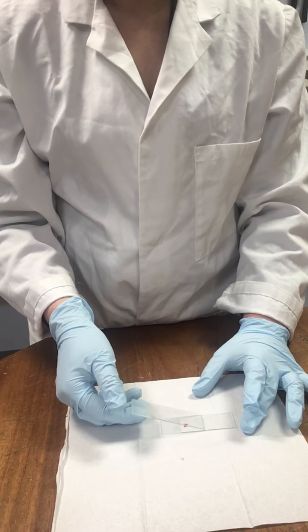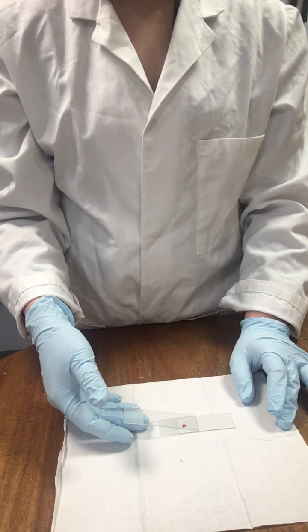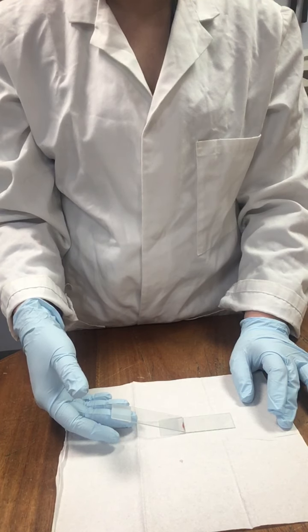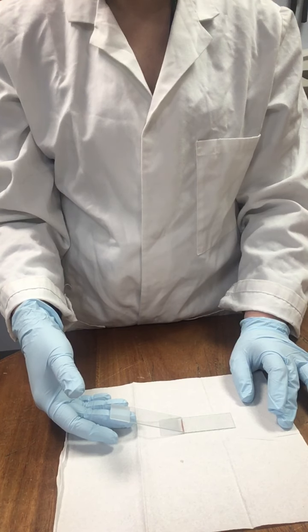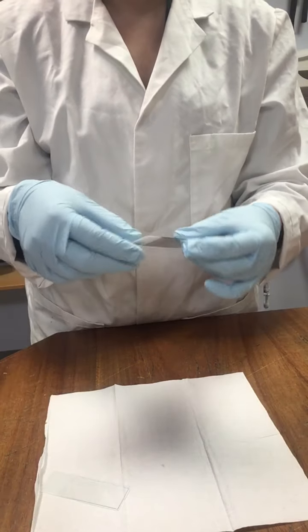My personal preference is I balance the slide on my middle finger, and I then tend to pull it and push it. So pulling the slide back initially, we want to place it in our blood, and we want to angle our spreader so that it stretches across the face of, or the edge of the slide. I hope you can see that on the video. And then gently, in as single an action as possible, we want to push it forward to give us our blood smear.